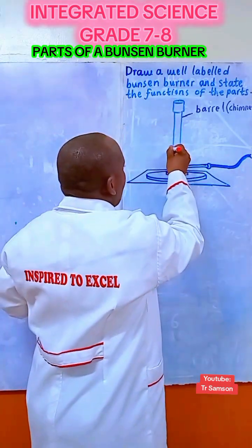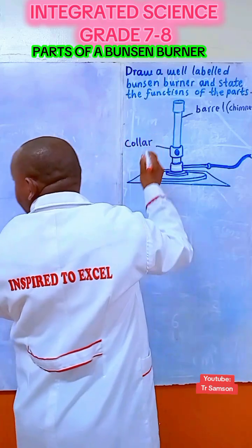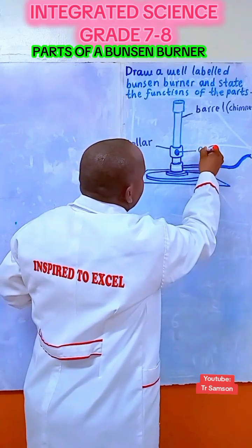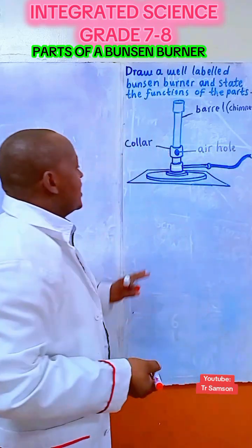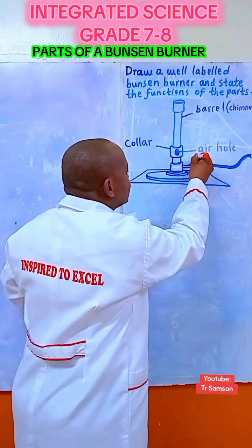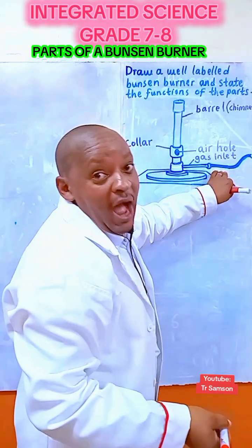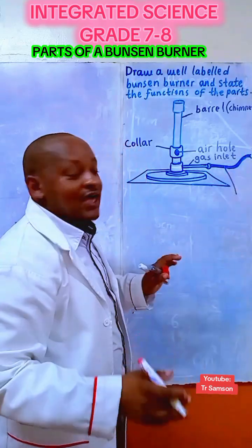This is the collar. And we have the air hole. Air hole. Next is the gas inlet. This is the gas inlet. And the rubber tubing. The rubber tubing.